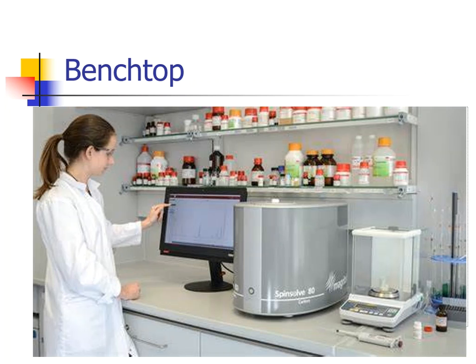That also means that they're not large magnets that get these things to operate, which is why you see the computers nearby them. This is just something a little bit more convenient, not very high powered. These instruments are wonderful for academic purposes, or maybe for purposes that don't need the bells and whistles that a big normal R&D NMR will bring with it.